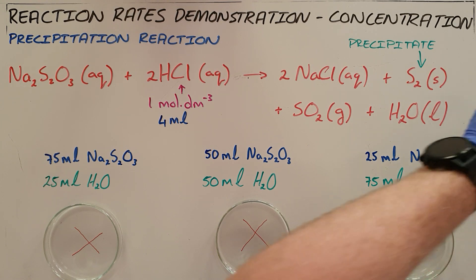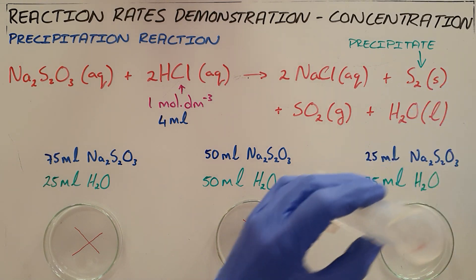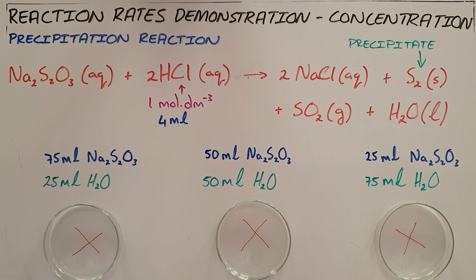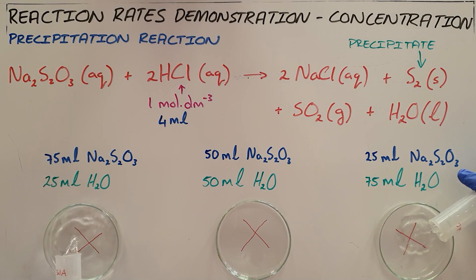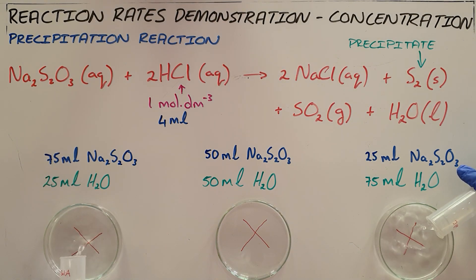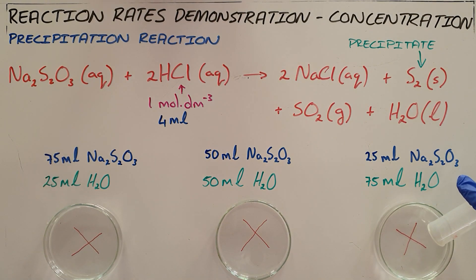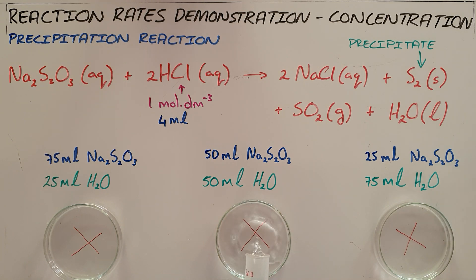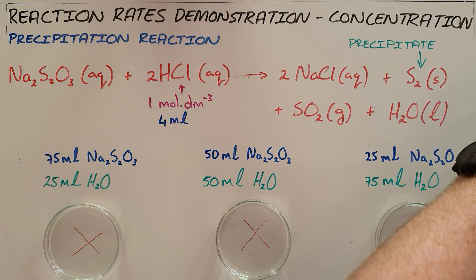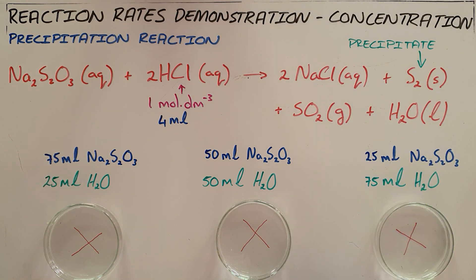So we're going to start by adding our sodium thiosulfate into each petri dish. You'll see that solution A is 75 mls sodium thiosulfate and 25 mls water. Solution B is 50-50, and solution C has 25 mls sodium thiosulfate and 75 mls of water.